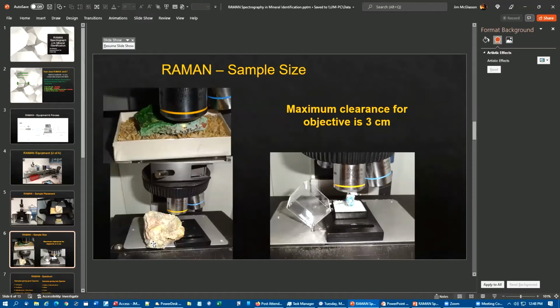Instead of putting it in, we normally use rice because rice allows you to position your specimen however you like without damaging anything and without sticking to the specimen. Some people use clay or tack, but if you are looking at the backside of a specimen that has fine crystals on it, you don't want to put tack on the crystals. So I've propped this one underneath there and used a plate to kind of hold it in place while I check these crystals.